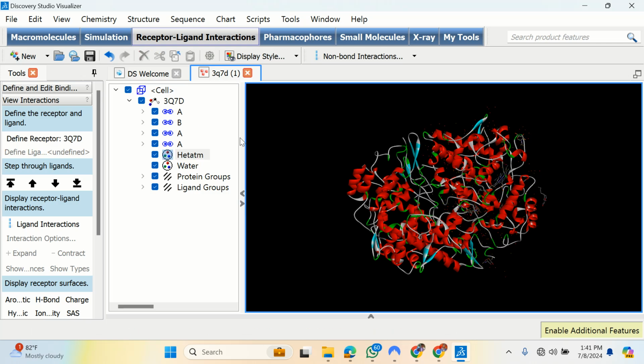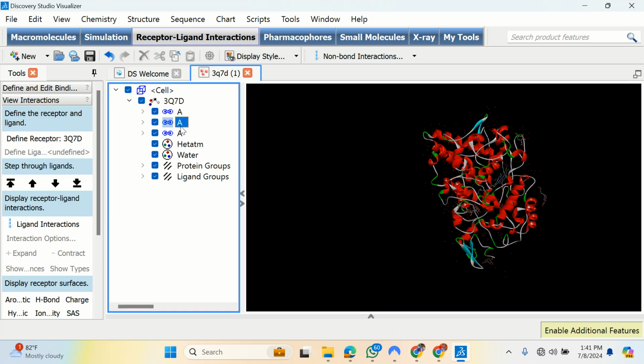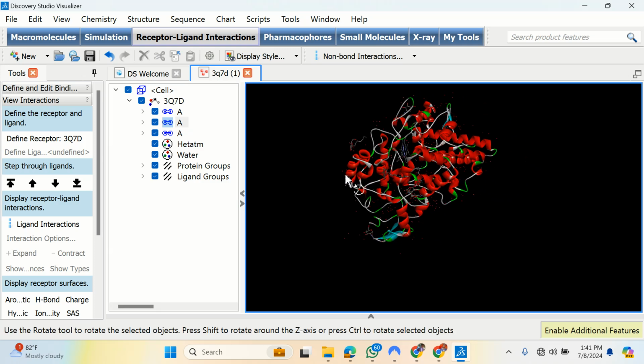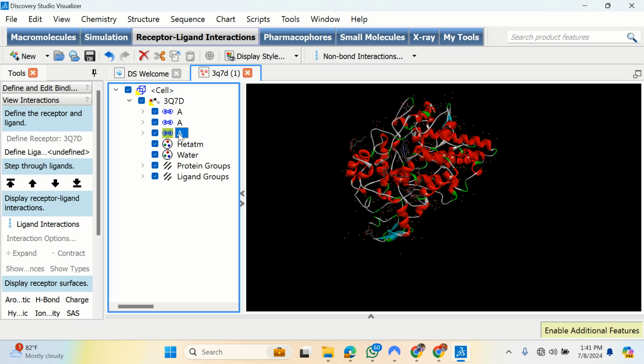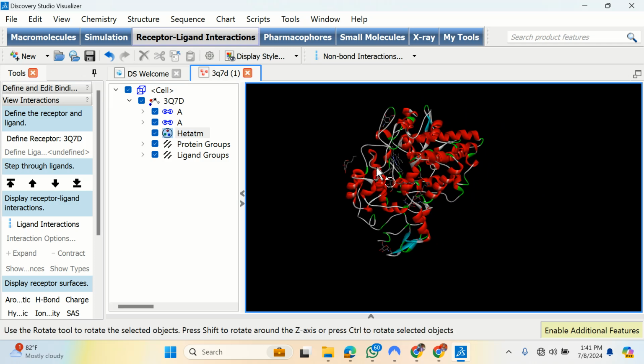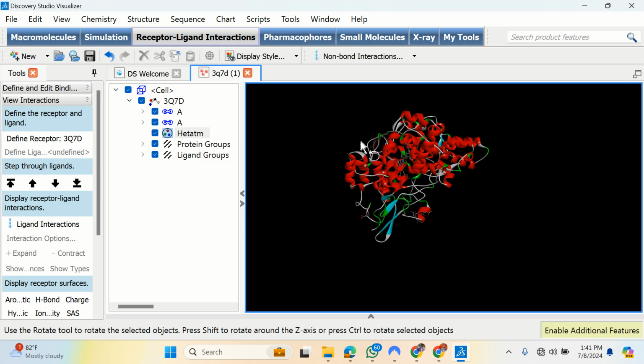Okay, so we have deleted this B before, so I'll take it off. So this is what we have, right? I will go ahead and delete my water. Okay, right? There's no water. This water, who can tell us what this water stands for? This water we just deleted. We believe it's water, right?